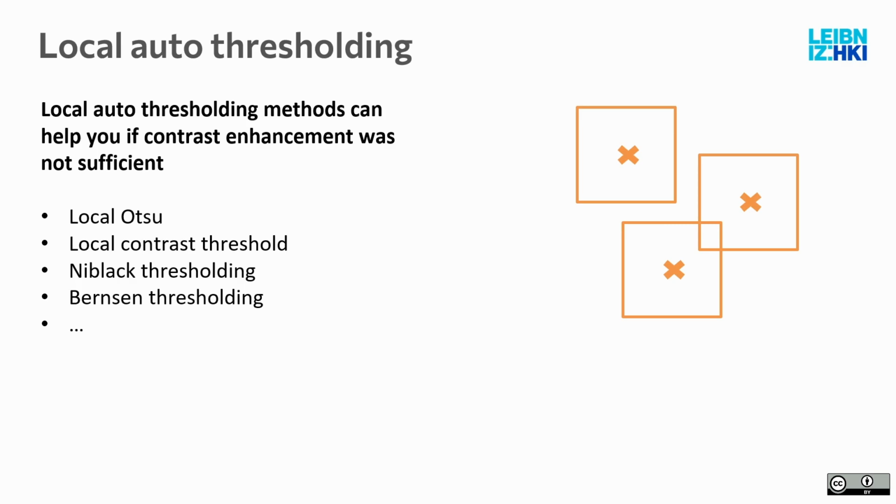They would do some testing if it's actually making sense. So it would, for example, exclude areas that are very, very dark and there's nothing there. Or less likely that there's nothing there. More likely there's nothing there. So keep these in mind if you are struggling with your thresholding and it does not react, or reacts unevenly to your image.